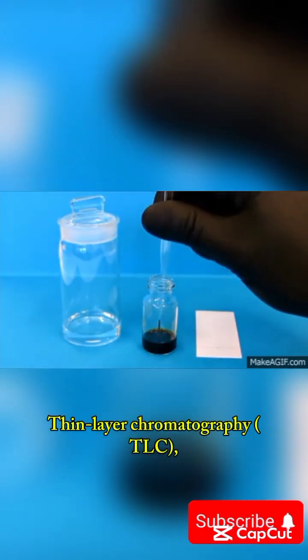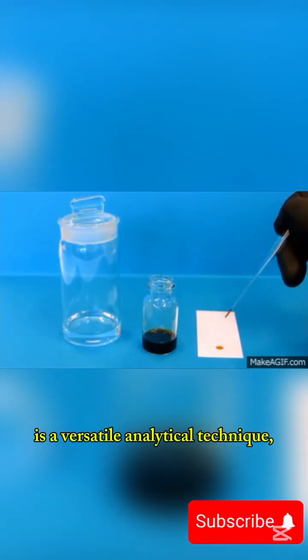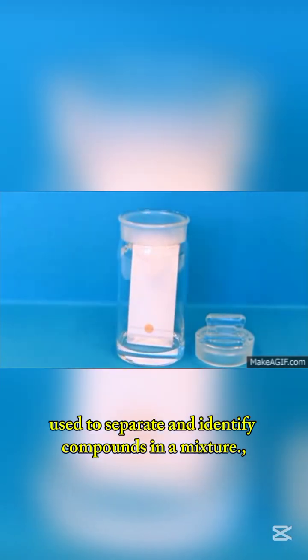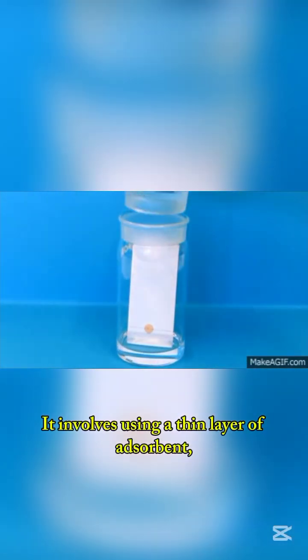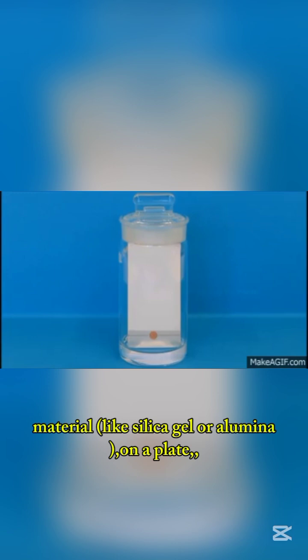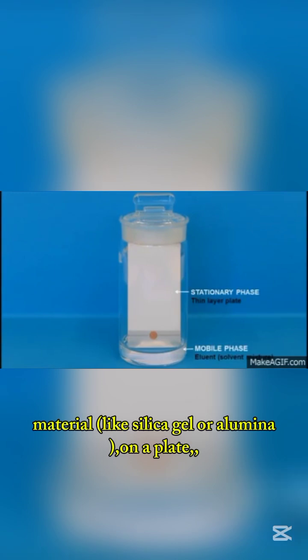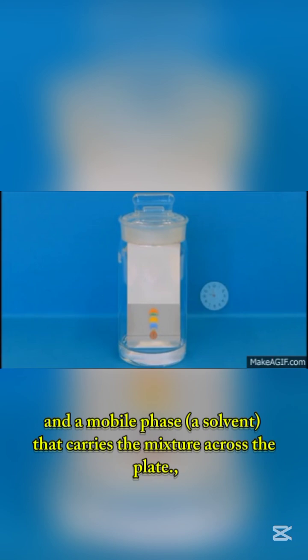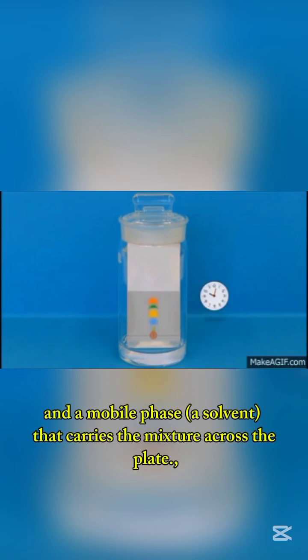Thin layer chromatography, TLC, is a versatile analytical technique used to separate and identify compounds in a mixture. It involves using a thin layer of adsorbent material like silica gel or alumina on a plate, which serves as the stationary phase, and a mobile phase of solvent that carries the mixture across the plate.